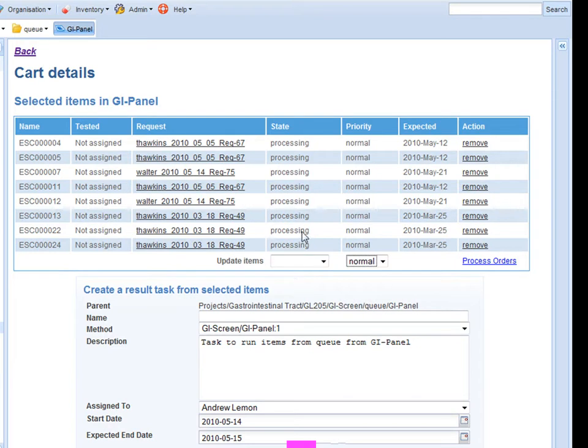This acts as a trigger for the system to make a real order in the inventory system. Because at this point I have accepted these items into my service group ready to be processed.